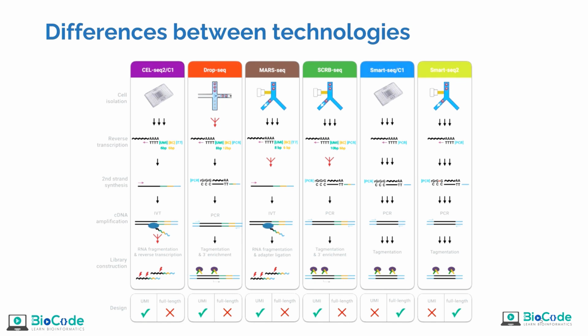A cellular barcode is also attached, so each cell has its own cell barcode. So no matter how many cells our sample has, each cell type will have its own cellular barcode. This allows us to identify cells after sequencing and allows us to identify transcripts after sequencing. The reason for that we will discuss further.